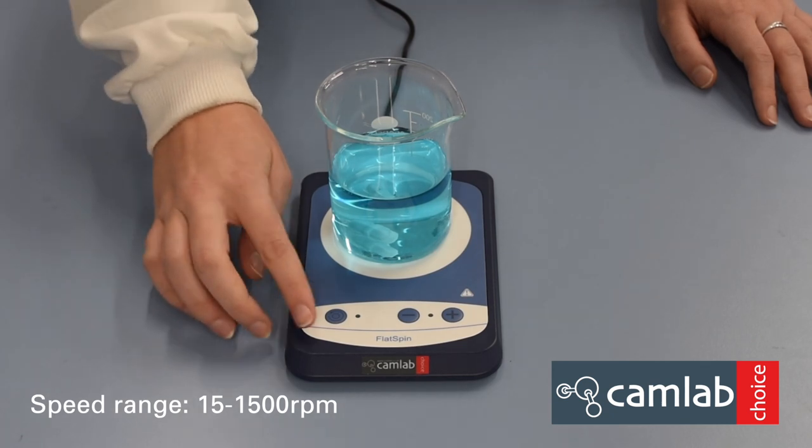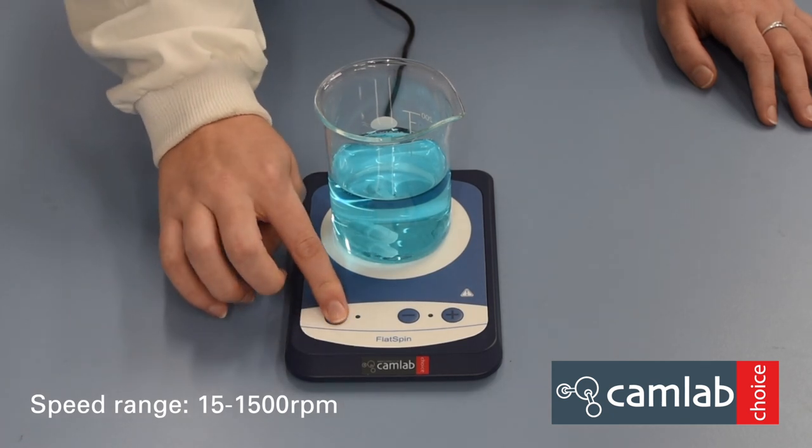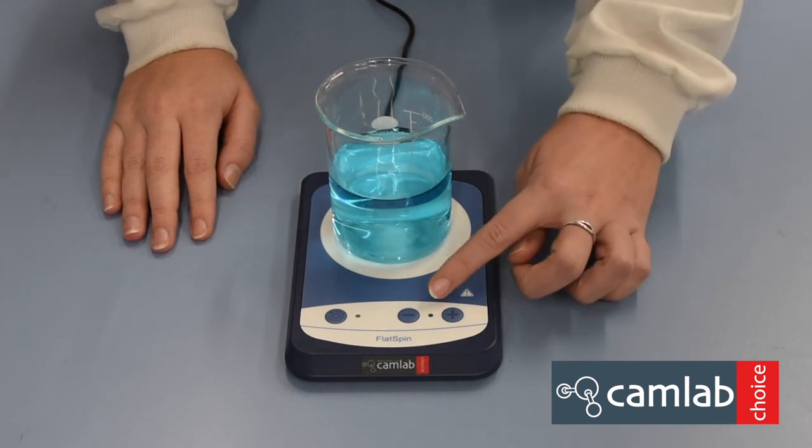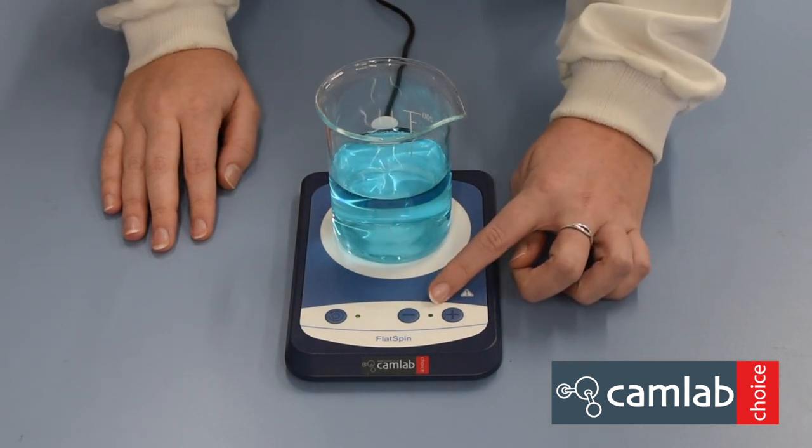To switch on your flat spin, press and hold the on switch for a couple of seconds until the lights come on. This light will flash until the set speed is reached.